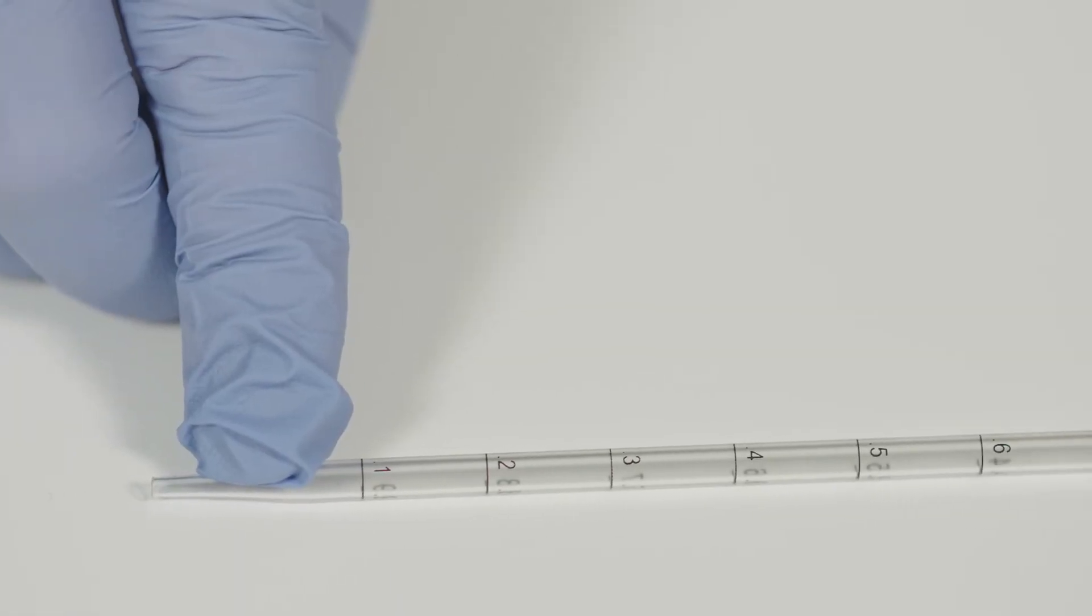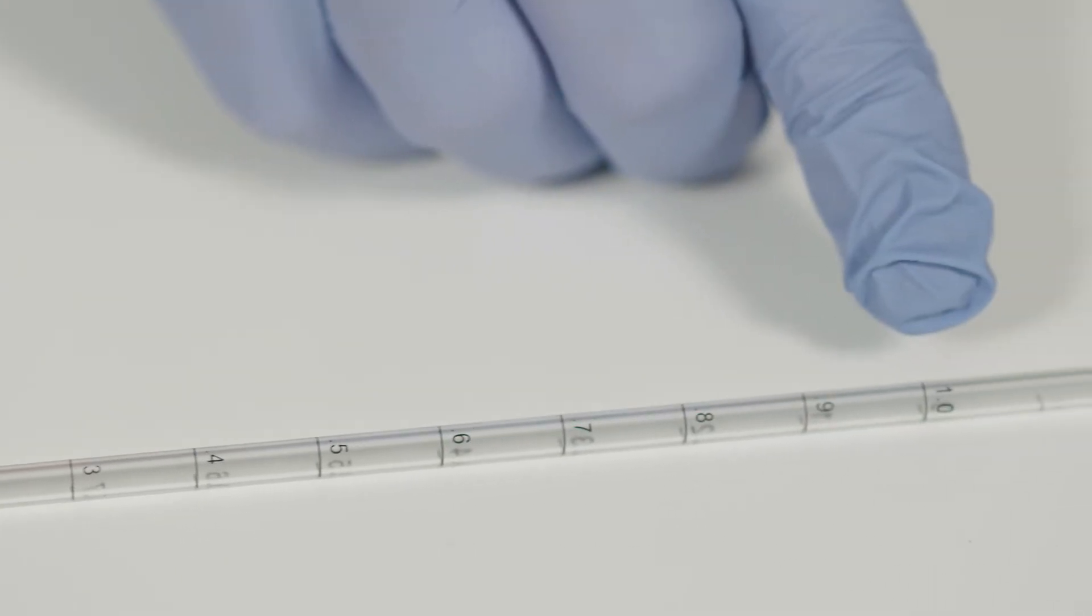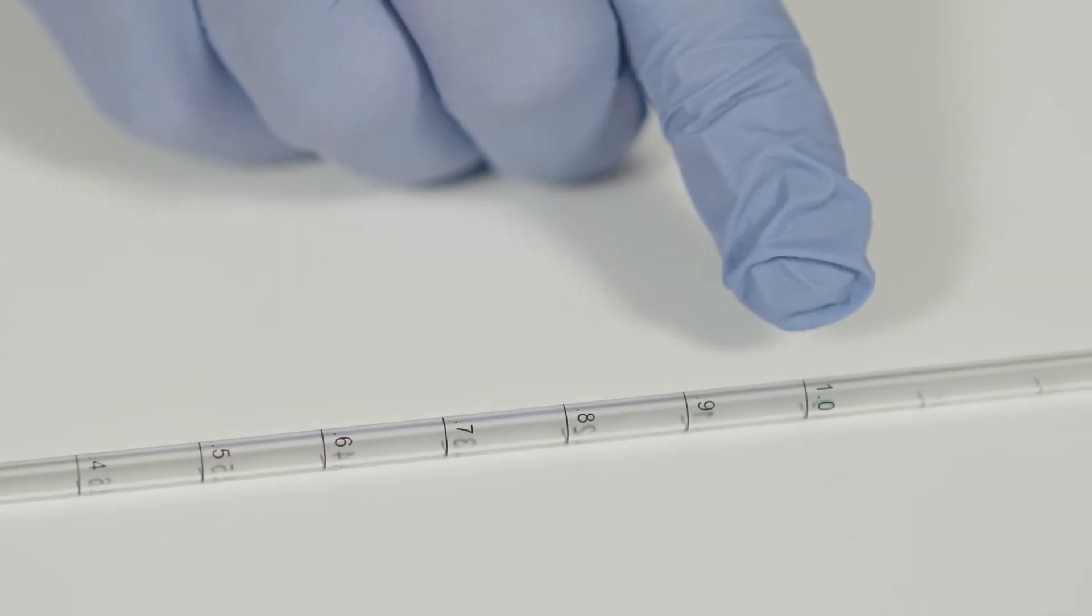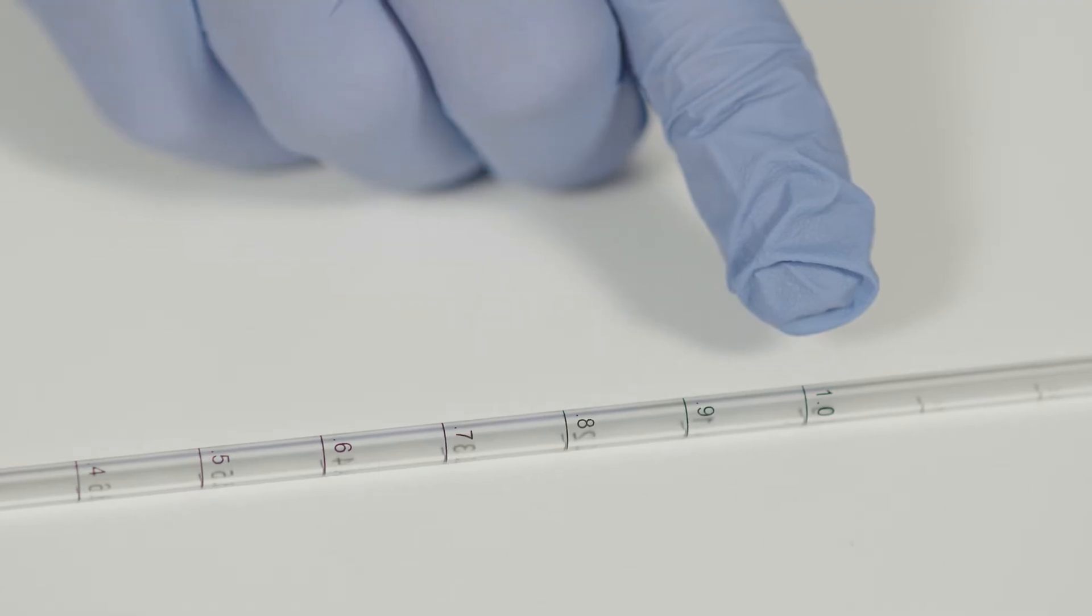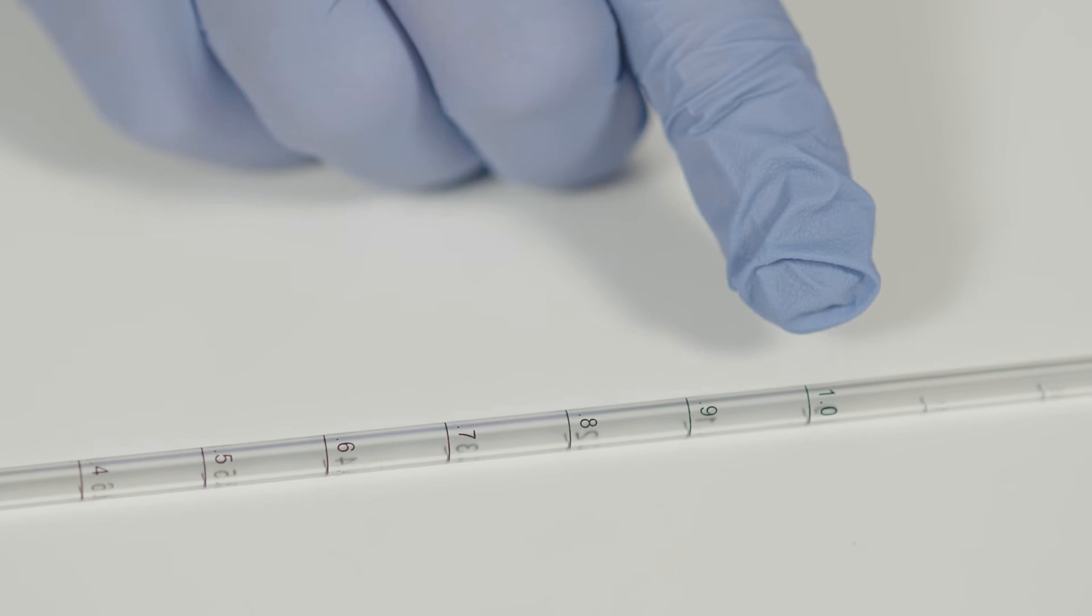Now take a look at the measurement scales. You can see there are two of them. One side goes from 0.1 at the bottom up to 1.0. This is the scale you use to measure how much you are pulling up into the pipette, how much liquid is contained there.